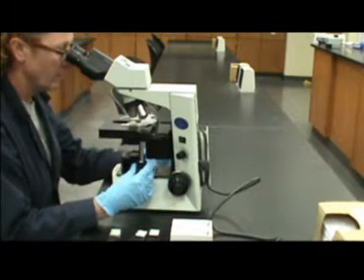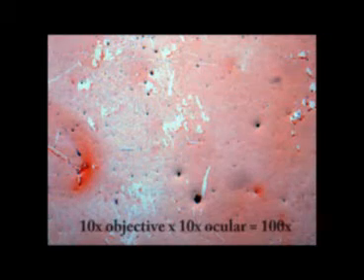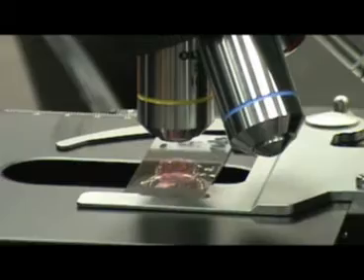Most microscopes have the property of parfocal. With parfocal, the image is focused on one magnification and then when switching to the next magnification, the image should remain somewhat in focus. Here is the same slide being observed with the 10x objective. This has a total magnification of 100x.